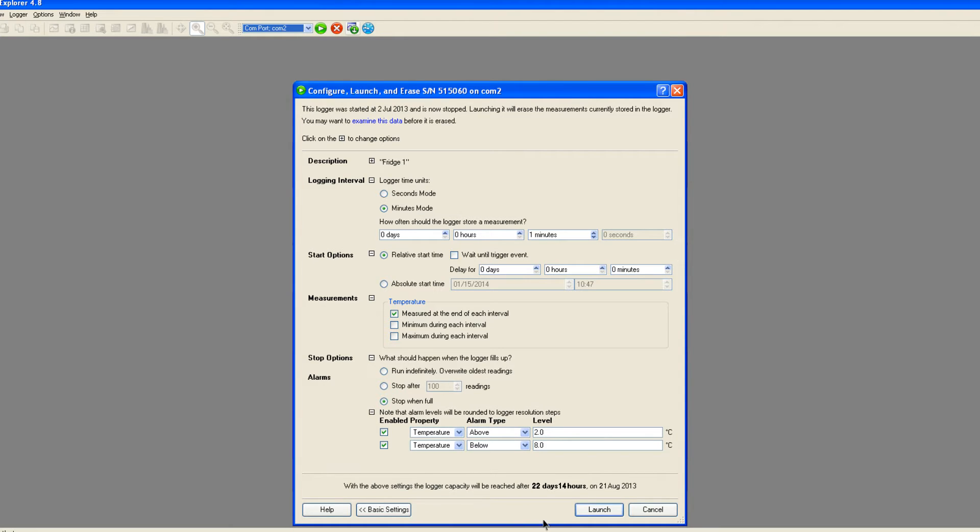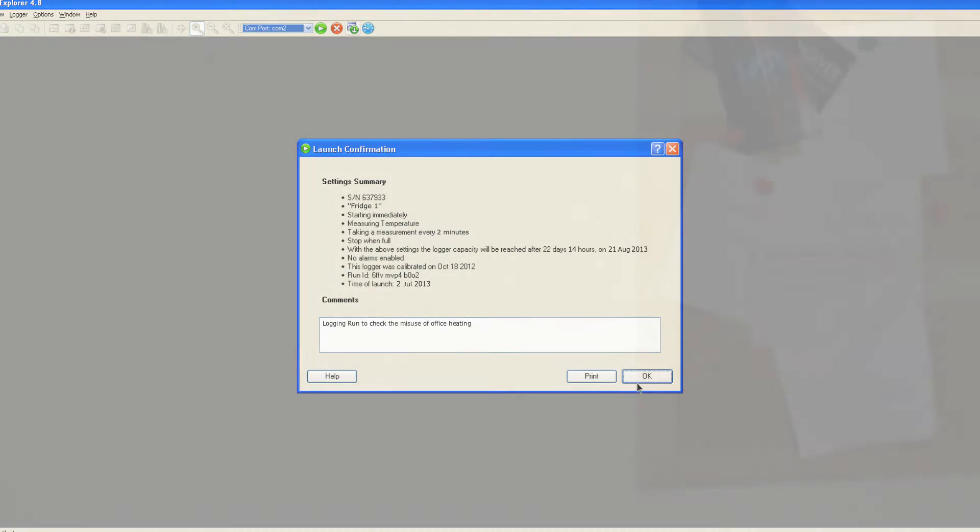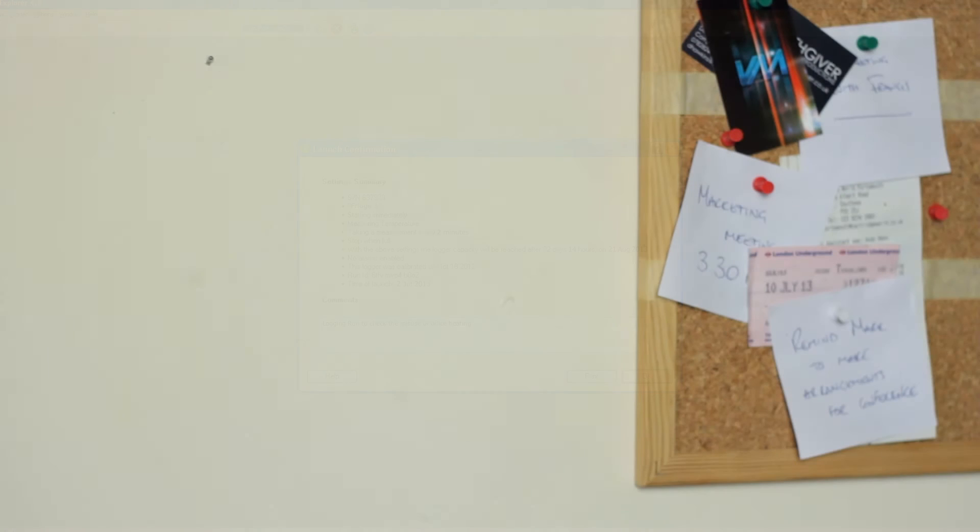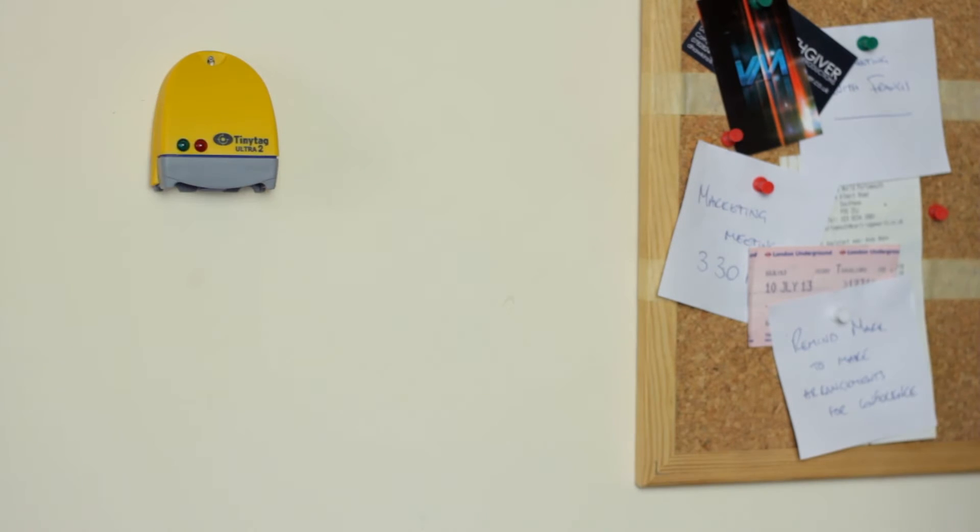When you are happy with the settings, click launch. You will see a summary of the settings which you can add comments to and print if required. Once this is done, the logger is ready to be positioned where it is going to record.